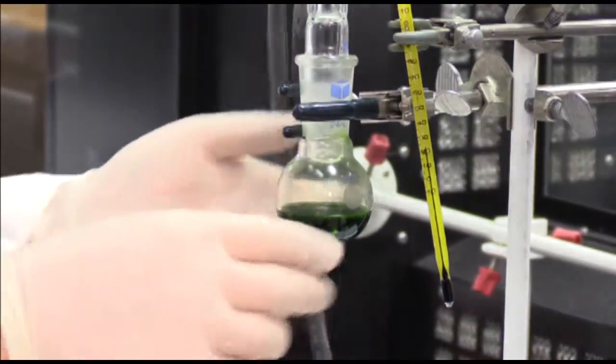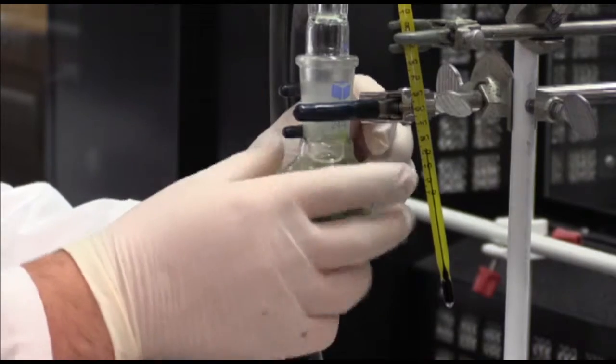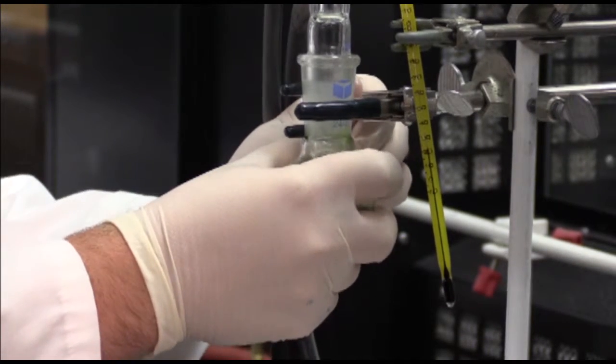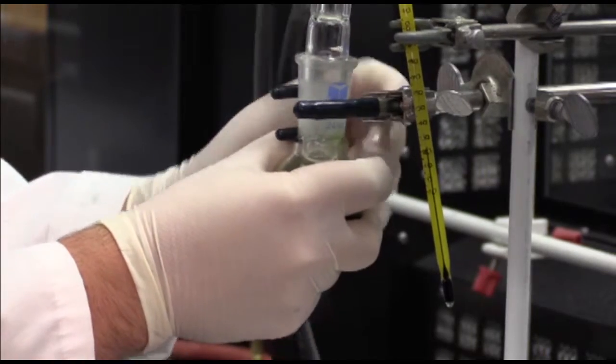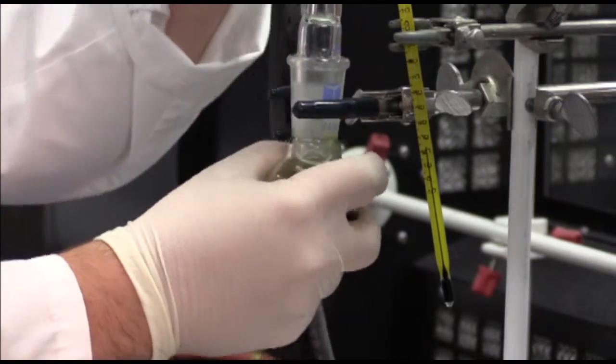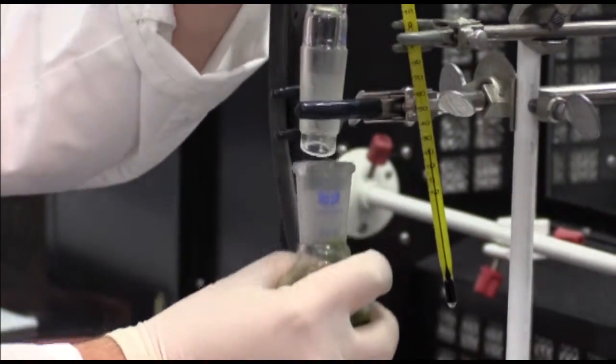you can now loosen the clamp that is around the round bottom flask and remove the round bottom flask.